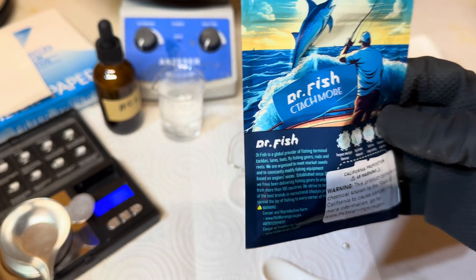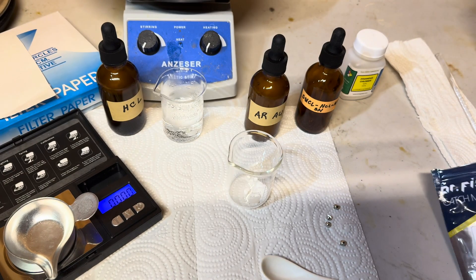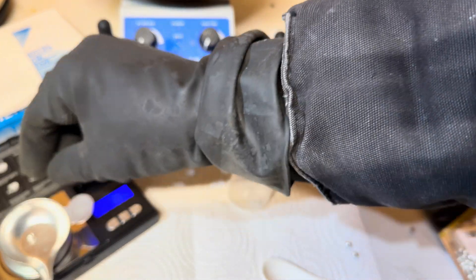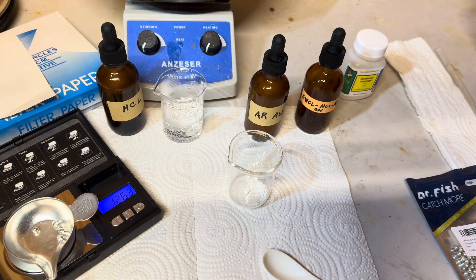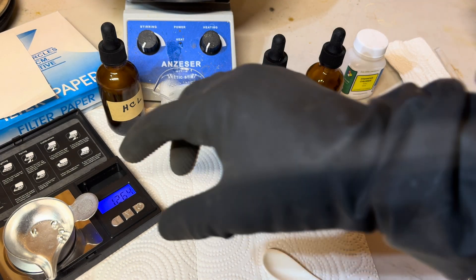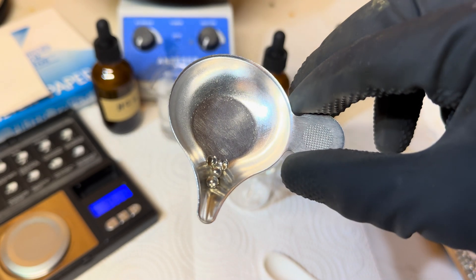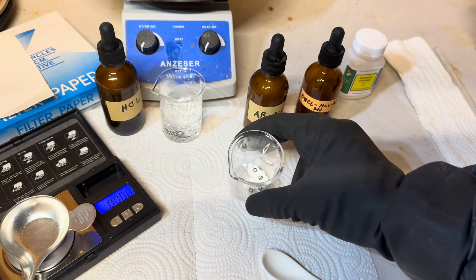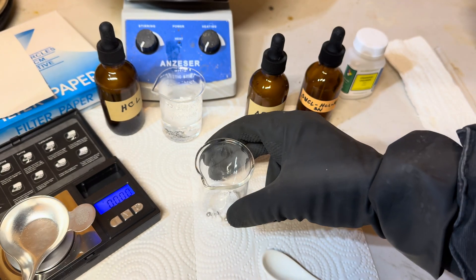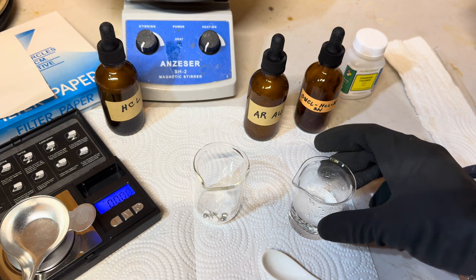This tin shot is made by Dr. Fish and they are tin weights for fishing. I purchased this on Amazon for $10 and there are 100 tin shots in a pack, but it only takes four tin shots for this process and these four tin shots weigh one and a quarter grams. Now, we will add in 25 milliliters of distilled water.